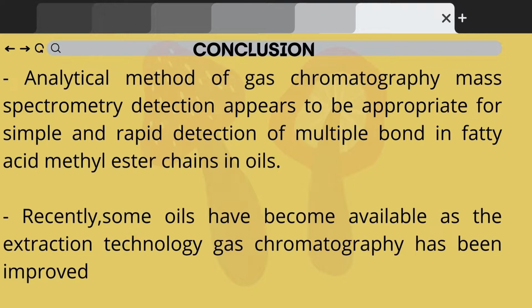The analytical method of gas chromatography mass spectrometry detection appears to be appropriate for simple and rapid detection of multiple bonds in fatty acid methyl ester chains in oils. Recently, some oils have become available as the extraction technology and gas chromatography have been improved.